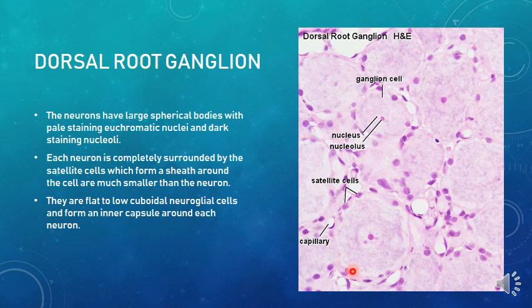The fibroblasts and collagen fibers form the outer capsule surrounding the satellite cell inner capsule. The main purpose of these satellite cells is to prevent unwanted depolarization of sensory neurons. So that is about the dorsal root ganglion: large spherical neurons, pale staining euchromatic nucleus with prominent nucleolus, and each neuron completely surrounded by many satellite cells.